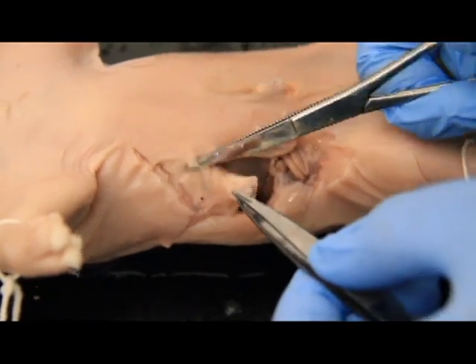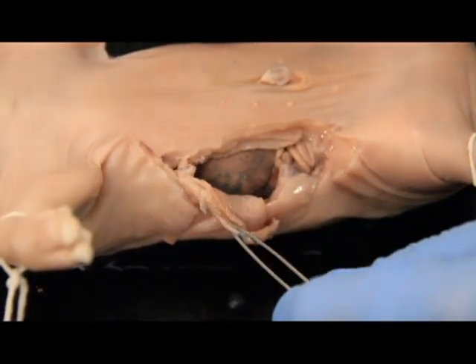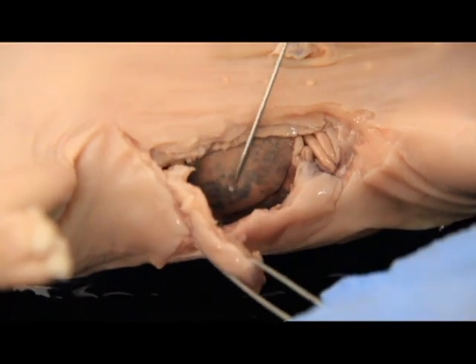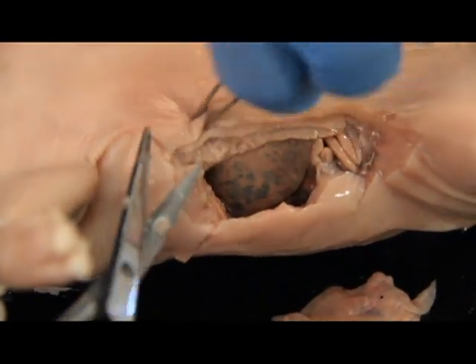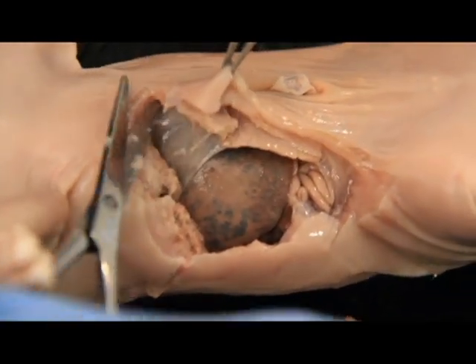So now we're removing this little piece of diaphragm, and you can see very clearly now that this just opens up nice and cleanly. And you can see right in there. See how nothing's really attached? And we can start to expose this liver. So now I can go ahead and make much larger cuts because I can see what I'm doing. And that's always the key, is you want to cut away so that you can continue to see what you're doing. And you might have to break through some ribs, and that's okay.